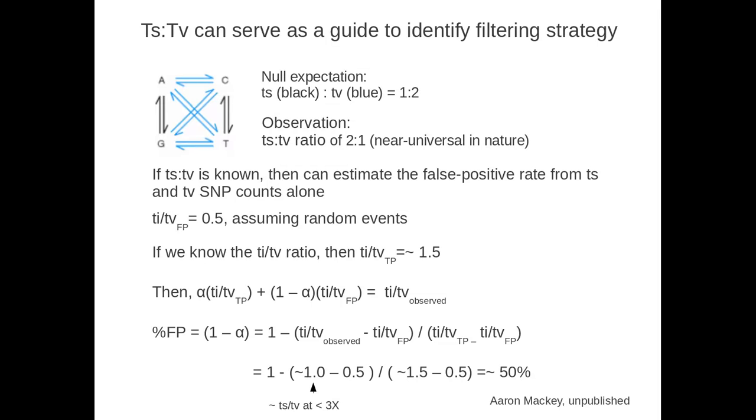What I expect for you to be able to do in this class is to execute the series of commands that will allow you to come up with a reasonable call set of SNPs, and to be aware of the potential issues that are out there, and to have some sense that there are issues out there. They're understood. What those issues might be, but in the case of many of the particularly non-human data sets, we have issues with identifying the sources of error and the problems with these call sets. And what I'm showing you here are methodologies that people working on non-model systems frequently revert to.